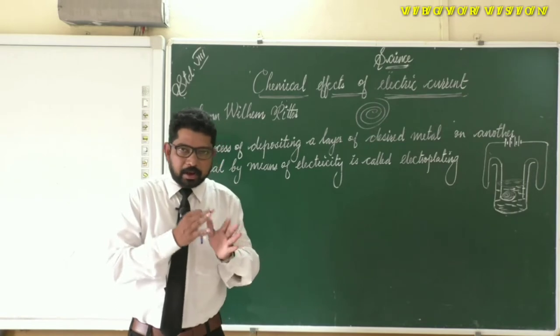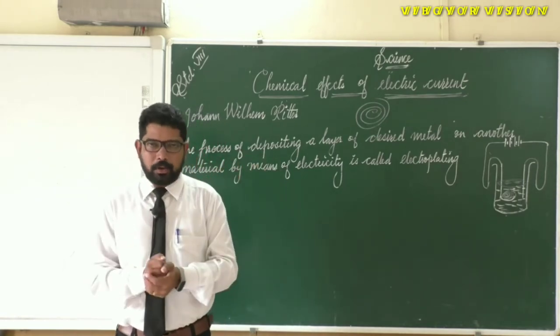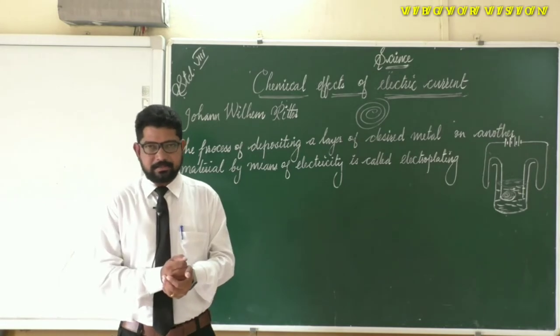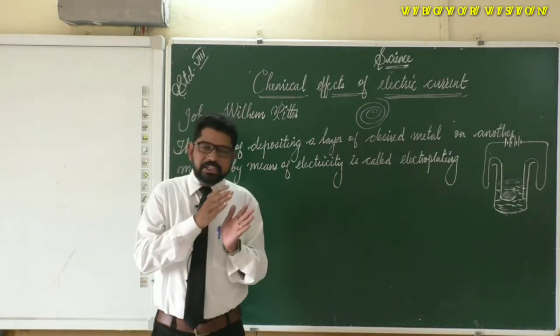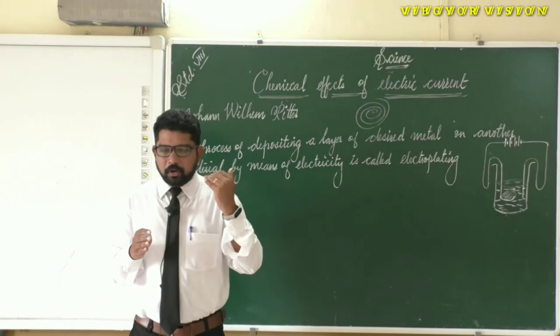What is vinegar? The chemical name of vinegar is ethanoic acid, also known as acetic acid. So we have added the copper coil to the acetic acid, and we have to leave it undisturbed for nearly 8 to 10 hours.